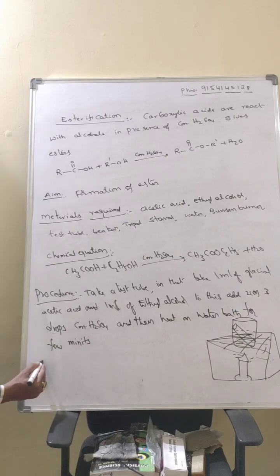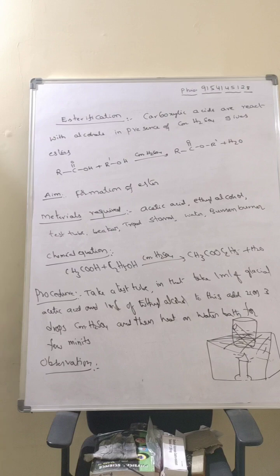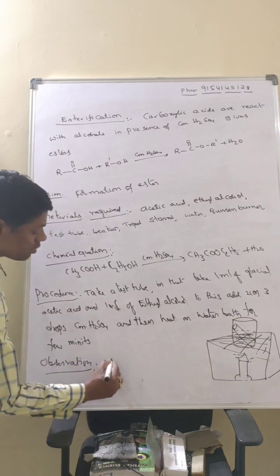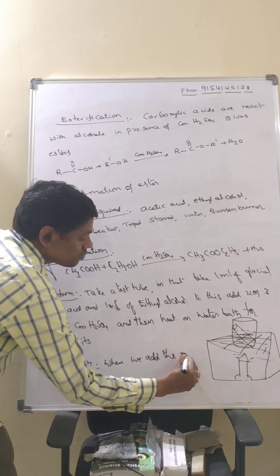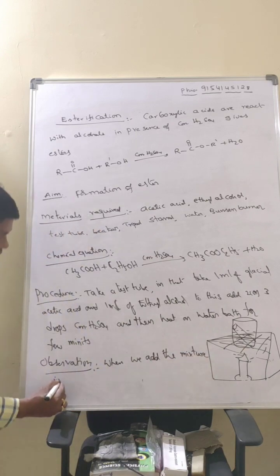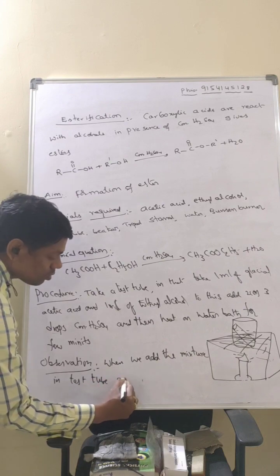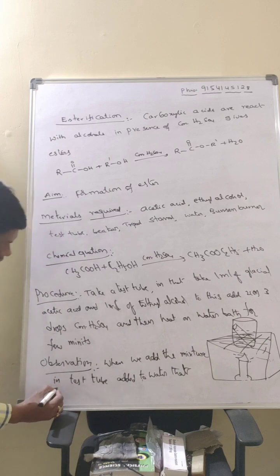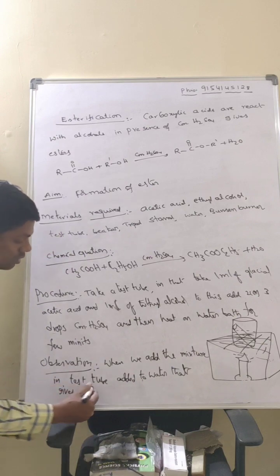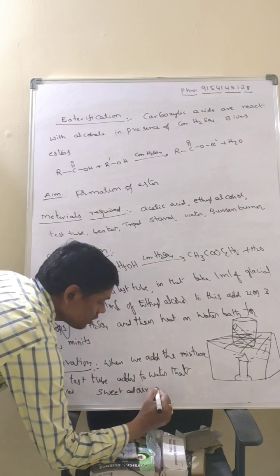Few minutes. Observation: when we add the mixture in the test tube to water, that gives a sweet odored ester.